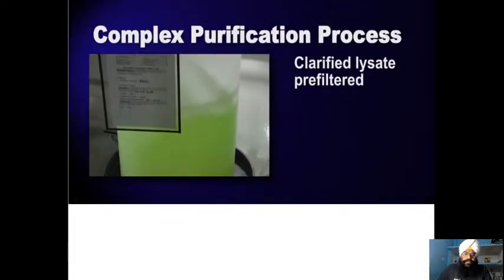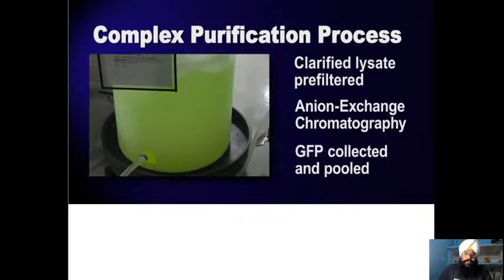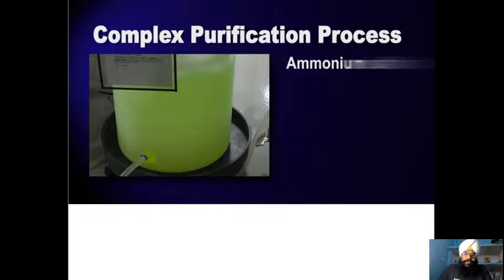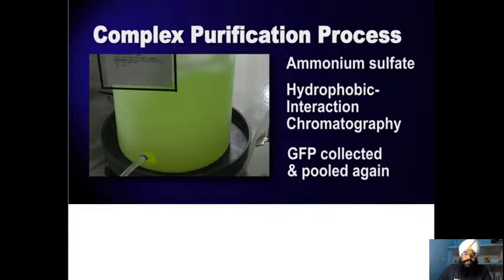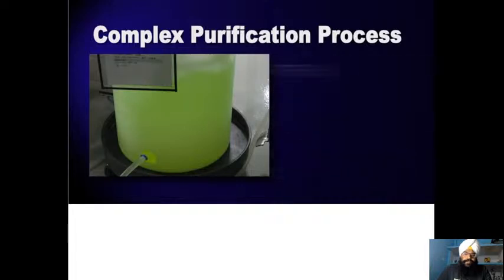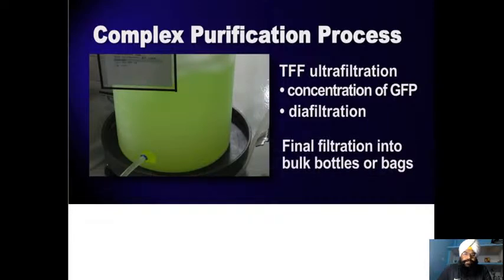The clarified lysate will be pre-filtered, go through anion exchange chromatography, and the GFP collected and pooled. Next, ammonium sulfate will be added to make the solution high salt, followed by Hydrophobic-Interaction chromatography, HIC. The GFP is then collected and pooled again. The solution then goes through a TFF ultrafiltration step, which includes concentration of the GFP followed by diafiltration to exchange buffer solutions and remove salt. And the process finishes up with final filtration into bulk bottles or bags.